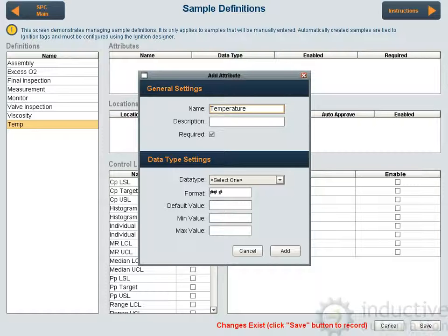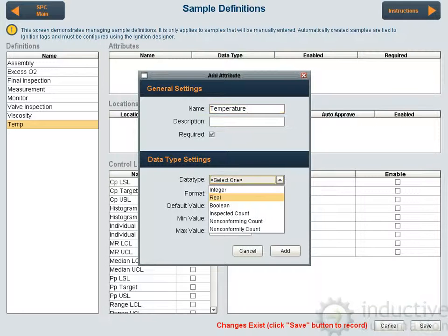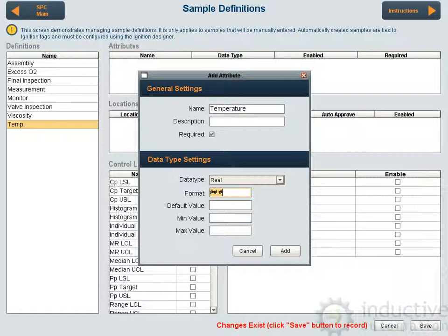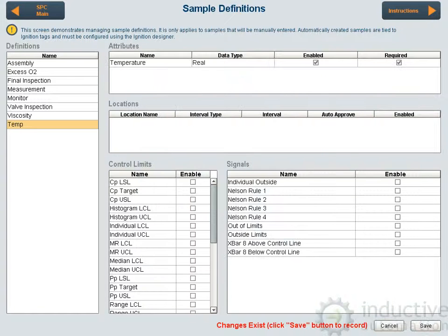For temperature, we want to collect the actual temperature value — it will be a real value. Here's the format; maybe we want to allow over a hundred degrees. There's a default value — if you leave it blank it will not put it in, but to save time for the operator or lab technician, sometimes it makes sense to put a default value in right away. The minimum value and maximum value work the same way — I'm going to leave those blank. We can see temperature goes in there.